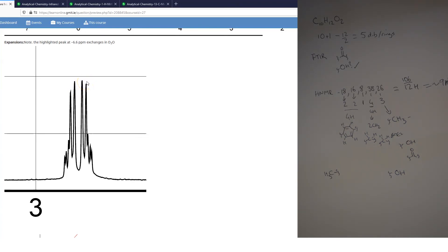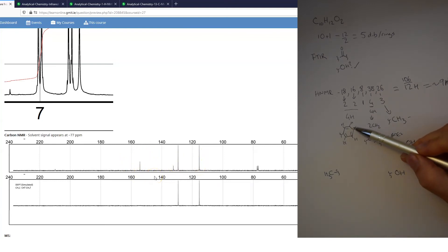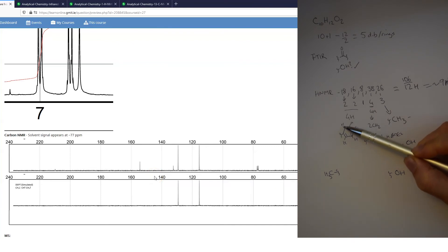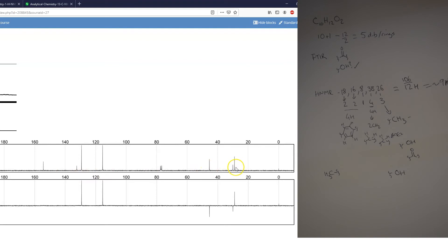Looking at the carbon NMR: it confirms things we already know. There's a carbonyl peak at around 210 ppm — very small and quaternary, disappearing in the DEPT because it's not an aldehyde with no attached hydrogens. There are four carbons in the aromatic region, and two of those disappear in DEPT, confirming a para-substituted aromatic ring — the only way to have two identical carbons giving just four signals. Then there are three carbons in the aliphatic region corresponding to two CH2s and the CH3, with the two CH2s pointing downwards in DEPT.